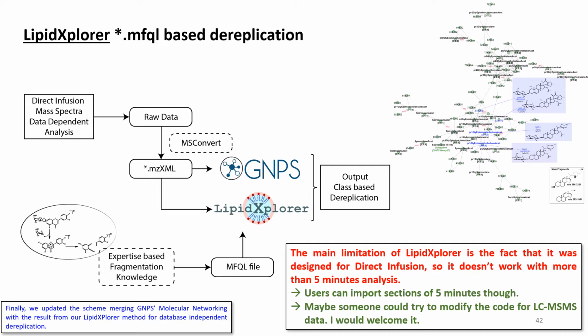The main limitation though of LipidXplorer is the fact that it is designed for direct infusion, so it doesn't work with more than 5 minutes analysis. Users can import sections of 5 minutes, and maybe someone could try to modify the code for LCMSMS data. I would welcome it.